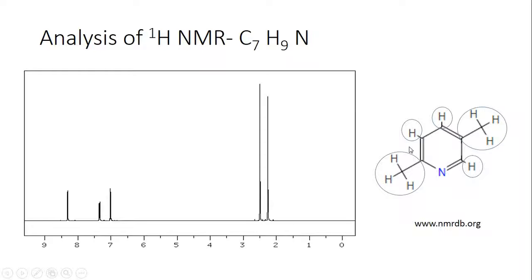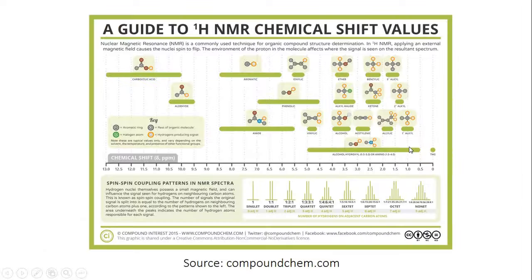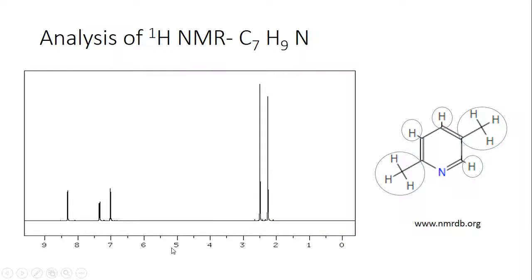So like carbon NMR, here's a table which shows the effect of electronegativity and functional groups on chemical shift. So again, we have an aromatic in this range right here, which does correspond if you factor in the downfield shifting. Something that was not used in carbon-13 NMR is integration, and that is the number of protons in each signal set.